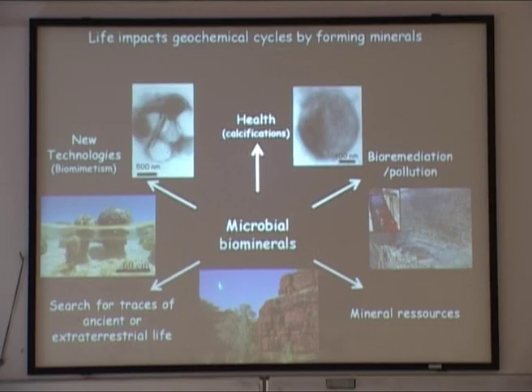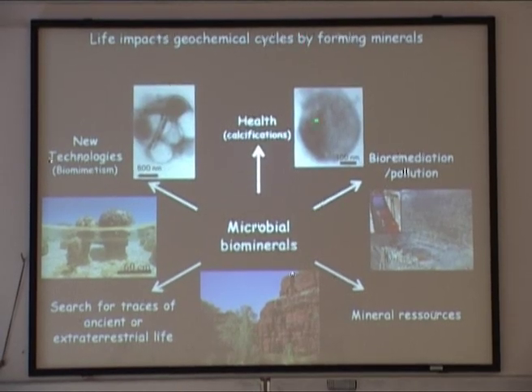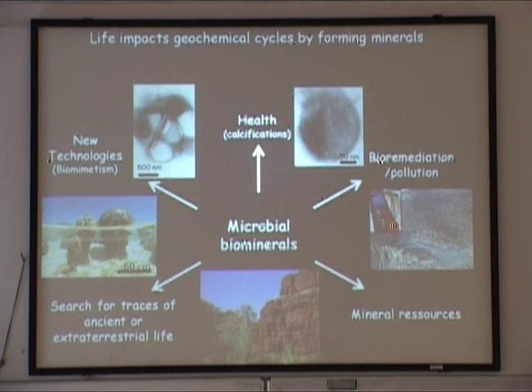The first one is a TEM, transmission electron microscopy, image of a bacterial cell that got encrusted in calcium phosphate minerals.